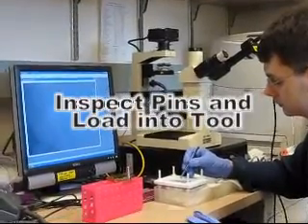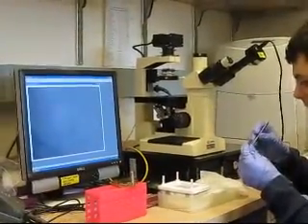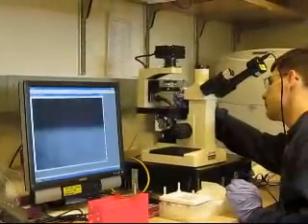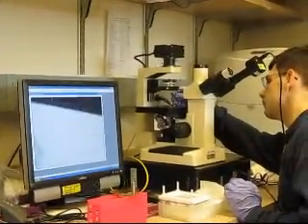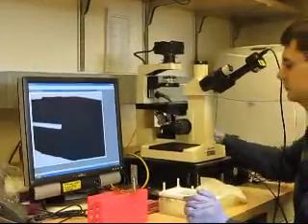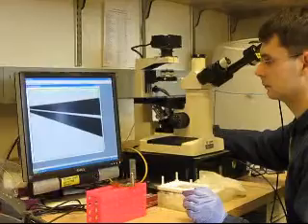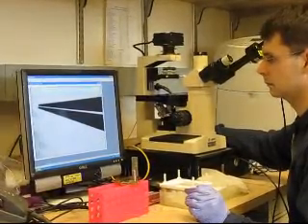Check the pins for debris or damage before loading them into the tool. Use forceps to place the pin onto a microscope slide. Check that the full length of the pin's channel is clear. Also check that the tip of the pin is not damaged.